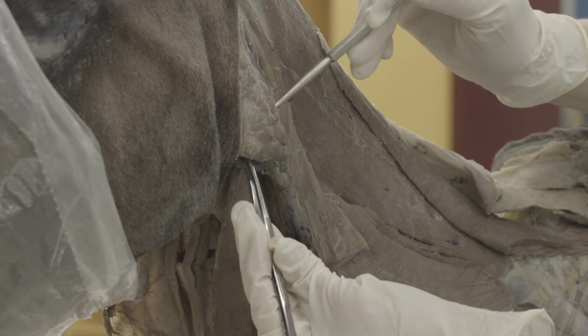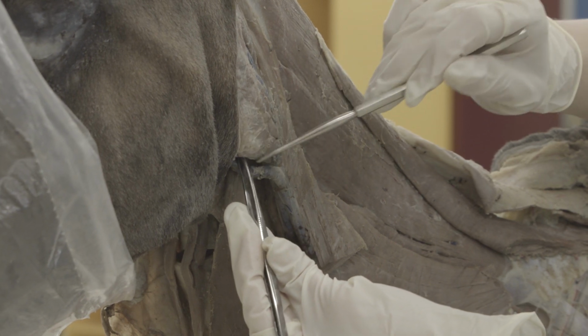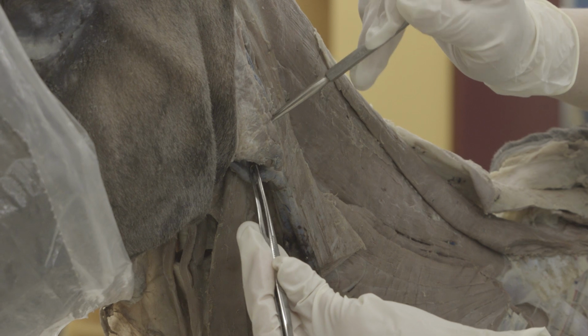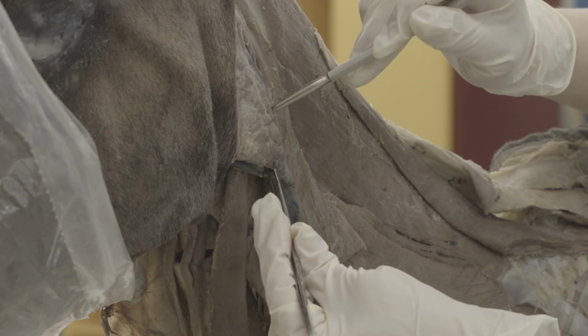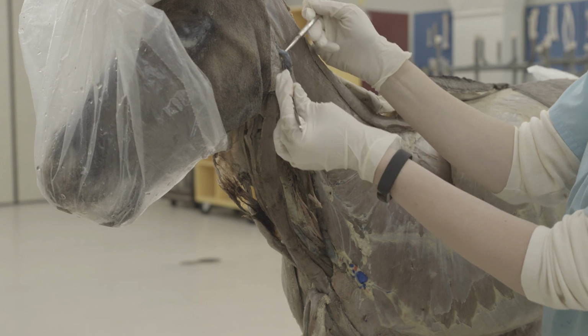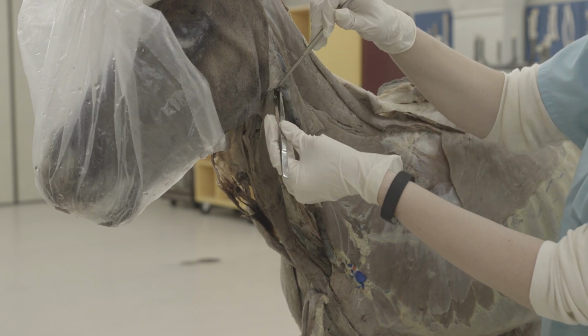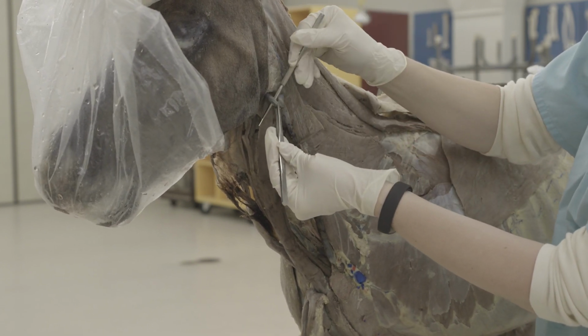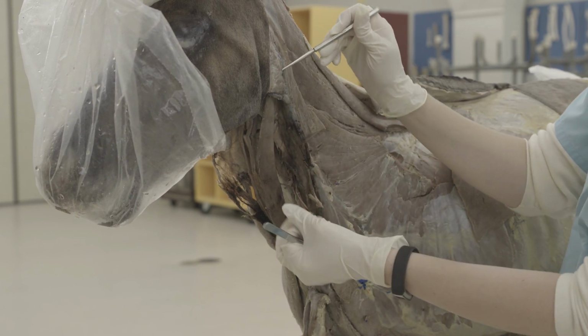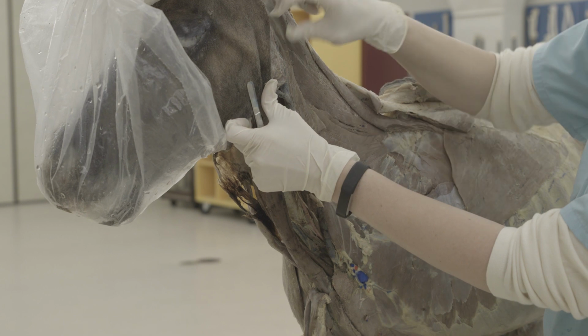And you have this little section of the parotid salivary gland also, and that will be slightly in your way, so you'll have to reflect that as well to see this area that I'm going to show you next. So parotid salivary gland, maxillary vein, linguofacial vein, and then external jugular vein. So you need to just reflect part of that parotid.